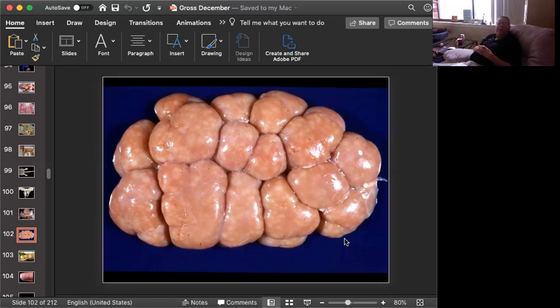And I can't tell you if this one is still suppurative. It looks a little less well demarcated, so I think maybe it's a lymphoplasmacytic, and this one is resolving. Probably most of the cases you see will be from veal calves or something like that, because it's got to be a very common problem, but the animals don't seem to be horribly affected by it.